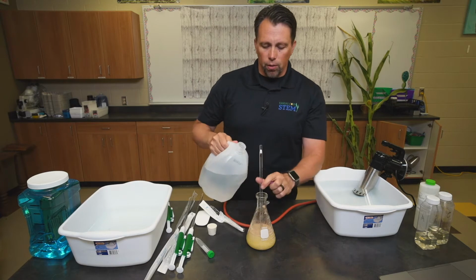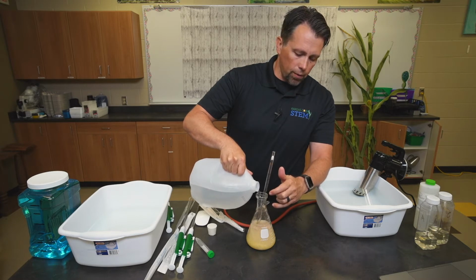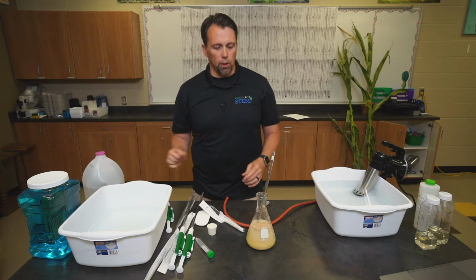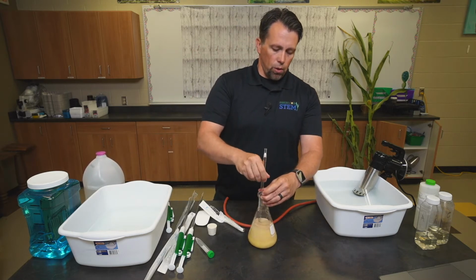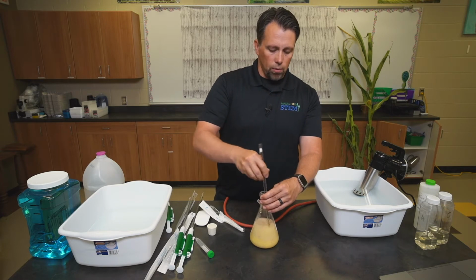It doesn't have to be distilled. I usually have enough distilled water in my room to use distilled. But you don't want to fill it all the way to the top. You want to leave about 100 milliliters worth of room at the top. So we fill it up to about the 400 milliliter line. And you can stir a little bit more. So this has everything in it that it's going to need to produce ethanol overnight.